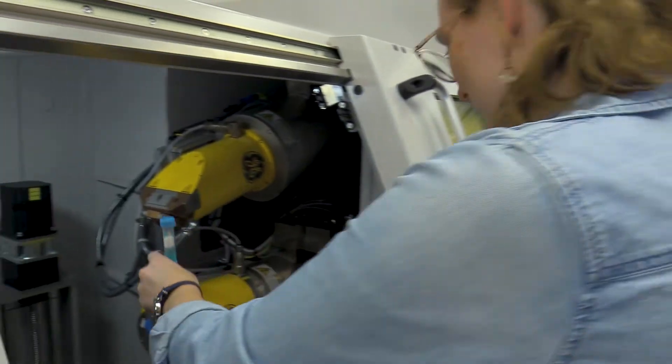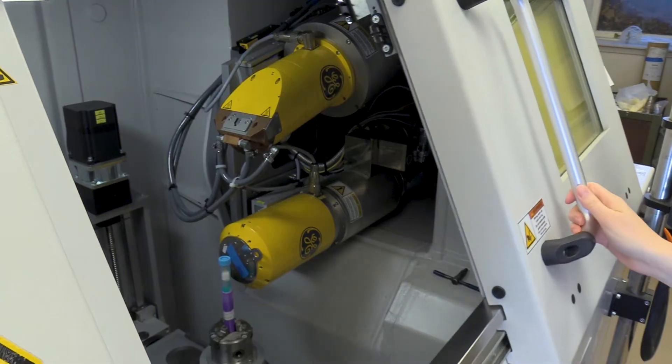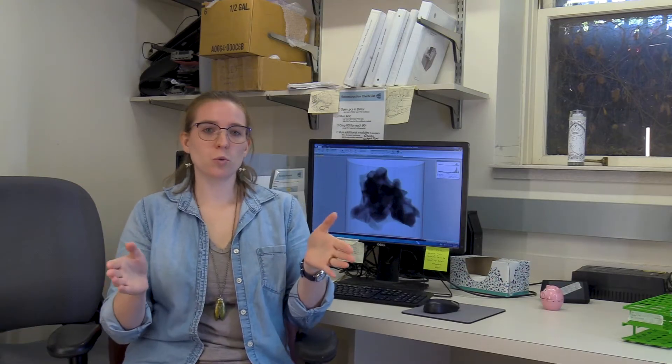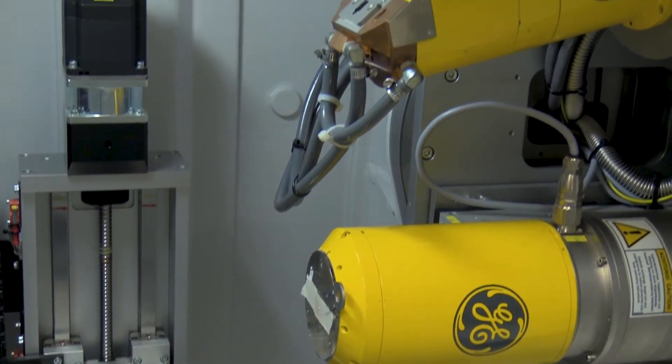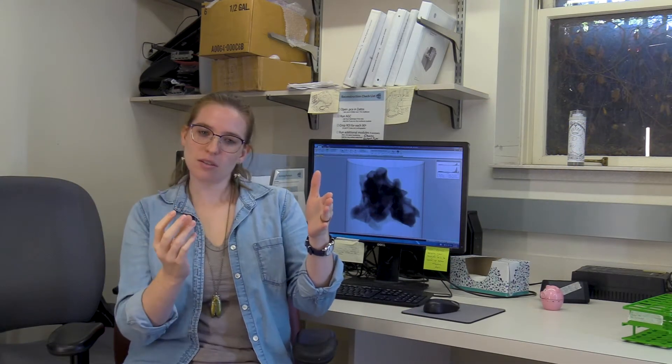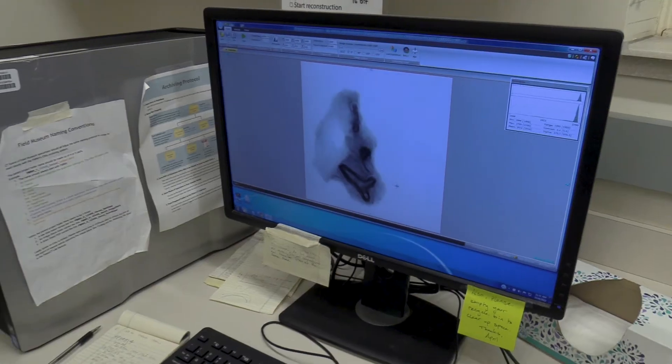My name is April Neander and I've been working at the university for 10 years. I'm a research specialist who manages the CT lab, runs the CT scanner, trains new users, and I'm also a scientific illustrator for the lab. Some people might be familiar with medical CT, where you stay stationary and the source and panel rotate around you. But in this industrial scanner, the source and panel stay still and the object rotates in the center as it takes X-ray images from multiple angles.